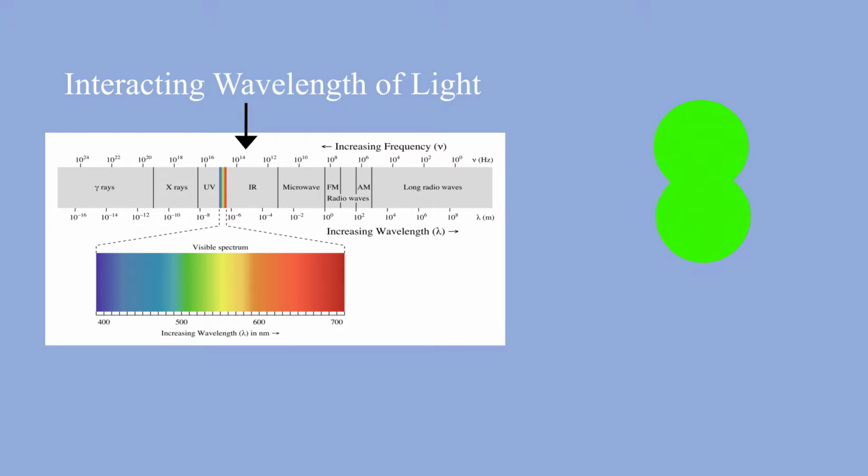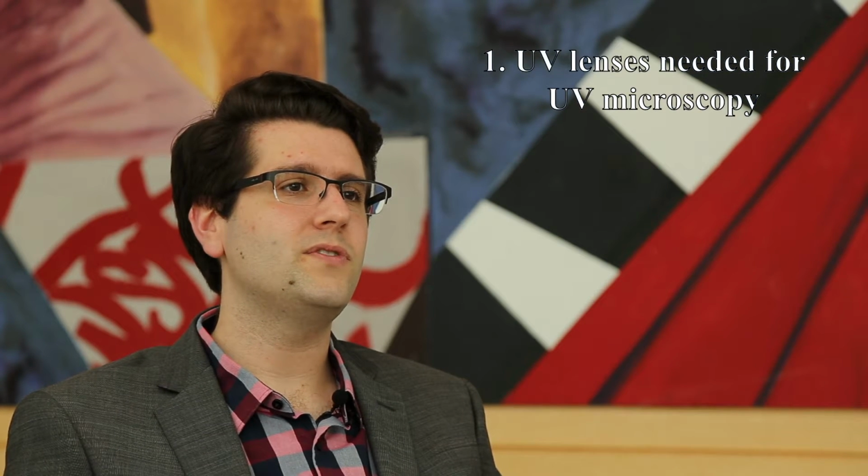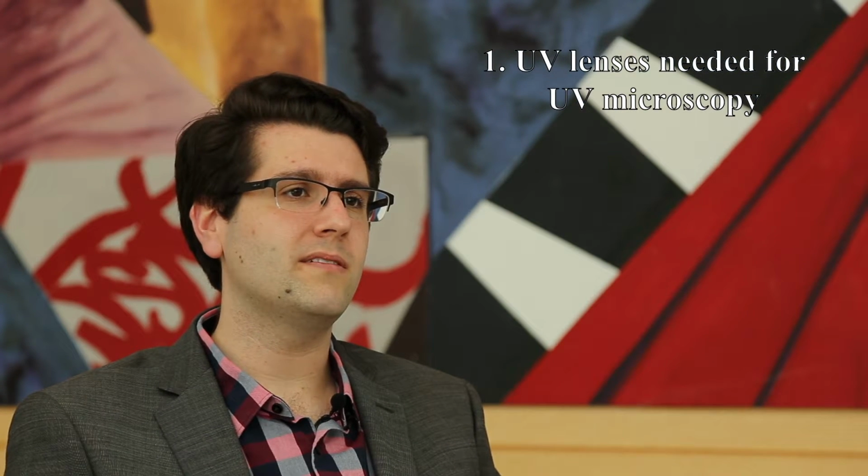If light of shorter wavelength could be used, then the ability to distinguish two objects from each other would be improved and smaller objects discerned. However, to use ultraviolet light, a few practical considerations needed to be made. The microscope lenses could not be made of glass, as they are not transparent to wavelengths shorter than 380 nanometers. UV lenses had to be designed for use in ultraviolet microscopy.